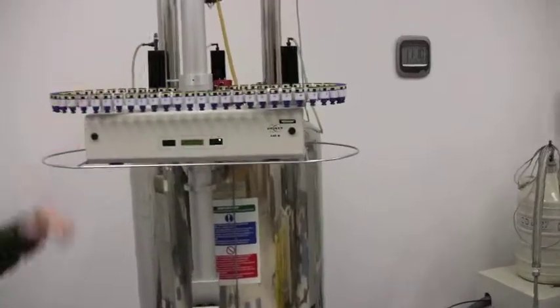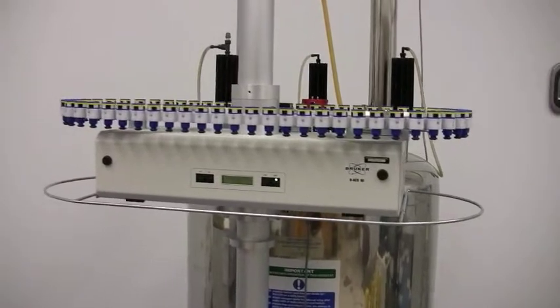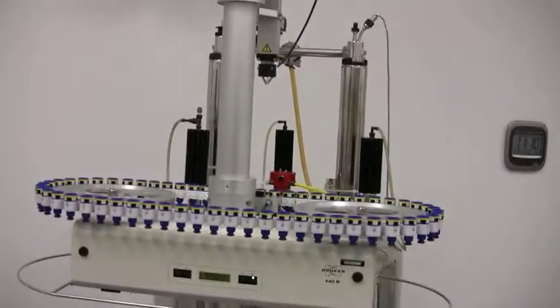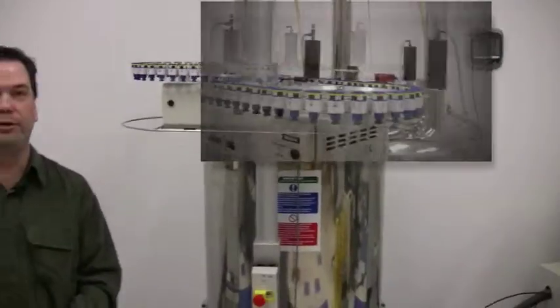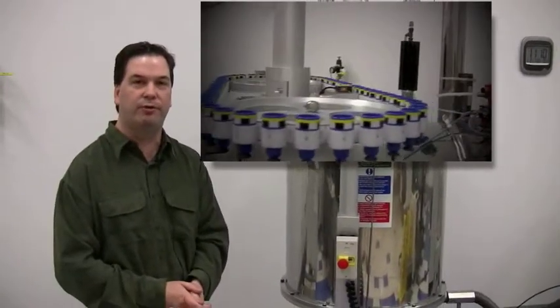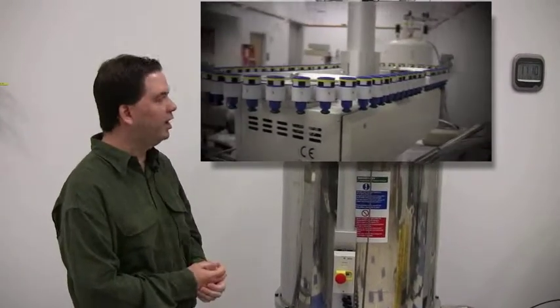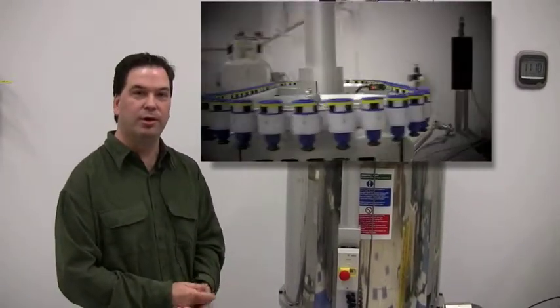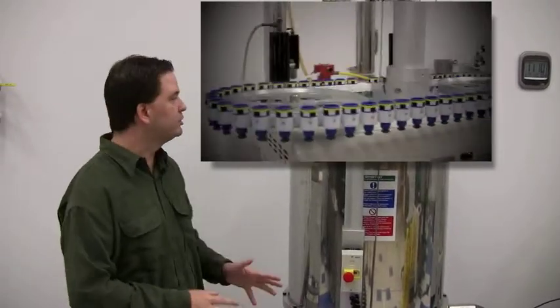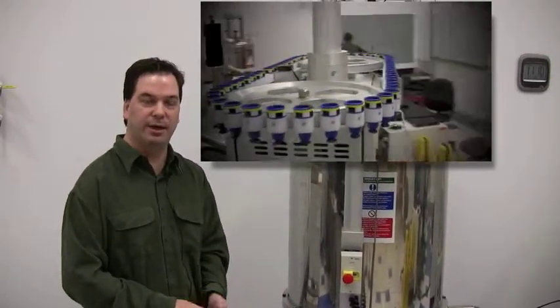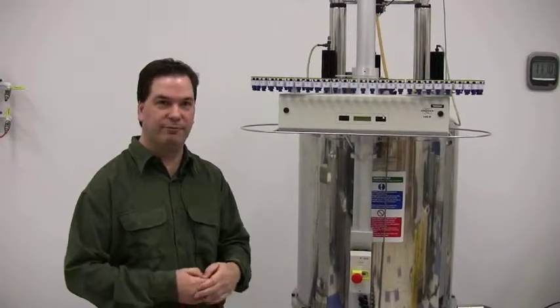Every afternoon at 4 o'clock, we switch over the operation of the spectrometer to the sample changer. Students just come on down, they enter information on the computer in terms of what type of experiment they want to run, how long they would like to run it, and then the sample changer automatically puts the sample in the magnet, runs the spectrum for it, ejects the sample, and it also sends the student a PDF copy of the spectrum, so they can take a quick look at it.